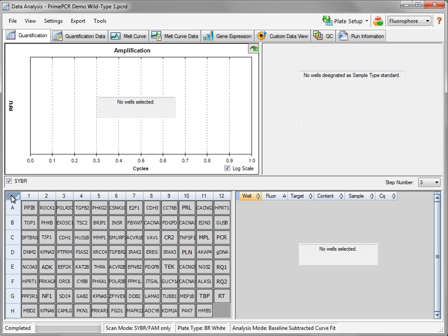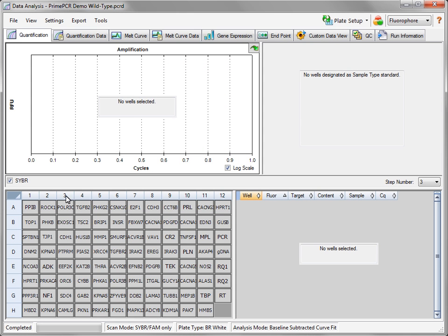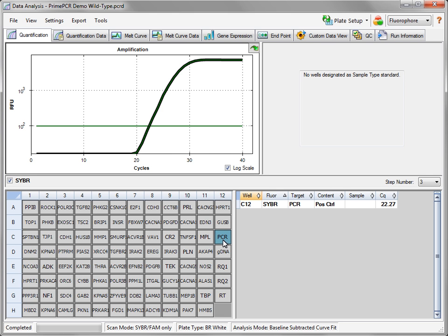PrimePCR plates contain several controls that should be evaluated prior to proceeding with gene expression analysis. The PrimePCR Positive Control Assay is designed to qualitatively assess the performance of a PCR reaction associated with a single sample. The assay may also be used to compare the relative performance of the PCR reactions associated with different samples.